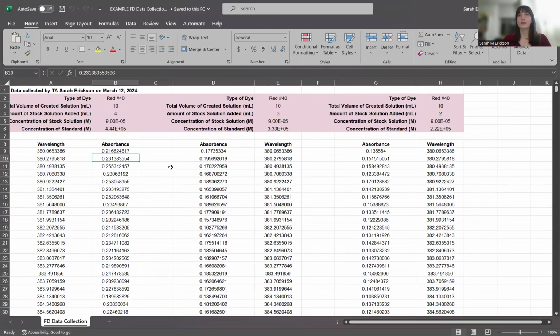The first thing that I'm going to do is say, all right, what if I don't remember what my spectrum looked like? I'm going to make my spectrum. What I mean by that is I'm going to recreate what I saw on the Logger Pro UV-Vis page. There's that page with the rainbow on it and you got some line.